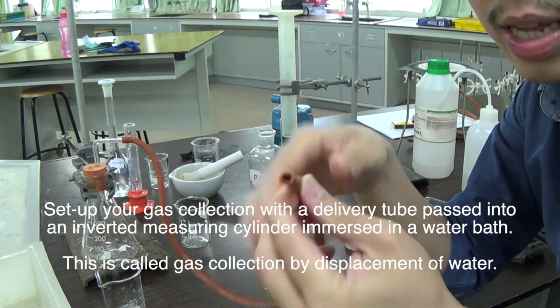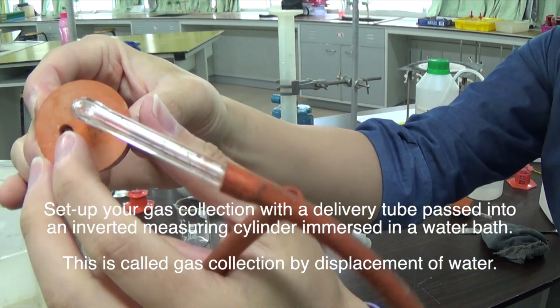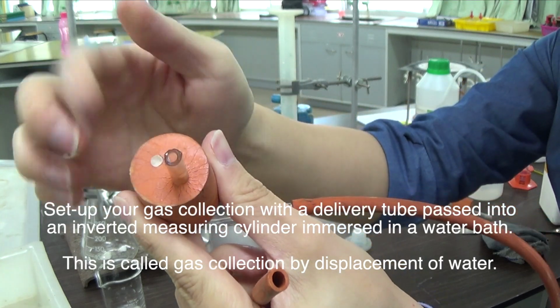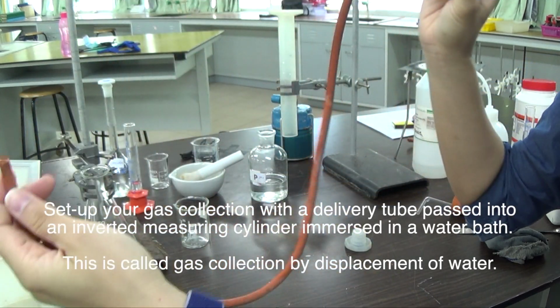This is a delivery tube. These are made of rubber. The gas will go up there. This looks like a hole, but it's actually been sealed on the other side, so the gas is not going to go anywhere through this hole. It's just going to pass through the inlet there, and then I have to collect the gas.